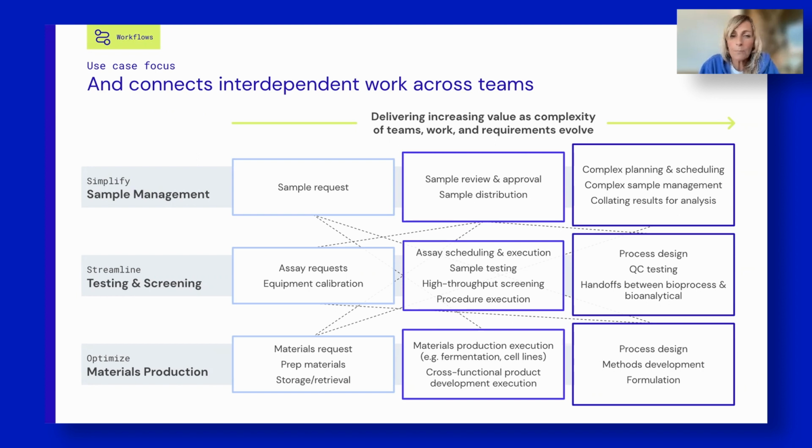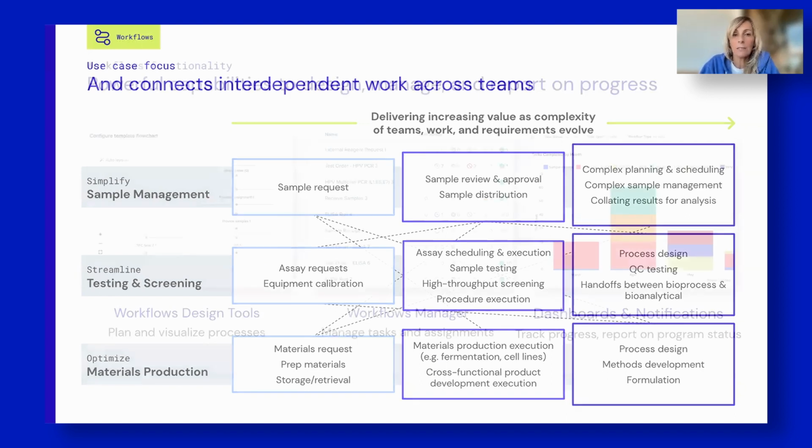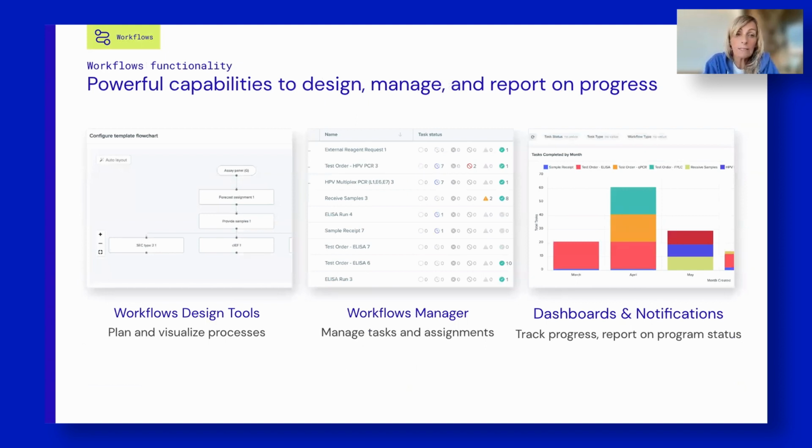I will jump into the product demo momentarily, focusing on processes designed for a QC lab to highlight this one use case. This demo will touch on many different capabilities within workflows, which are organized into 3 different buckets: design tools, tools to manage workflows in real time, and dashboards and notifications. You may have seen last quarter's What's New webinar where my colleague Chelsea Kowalski demoed the Workflows Manager and dashboards and notifications. Today, I will focus on the latest functionality for process design in particular.